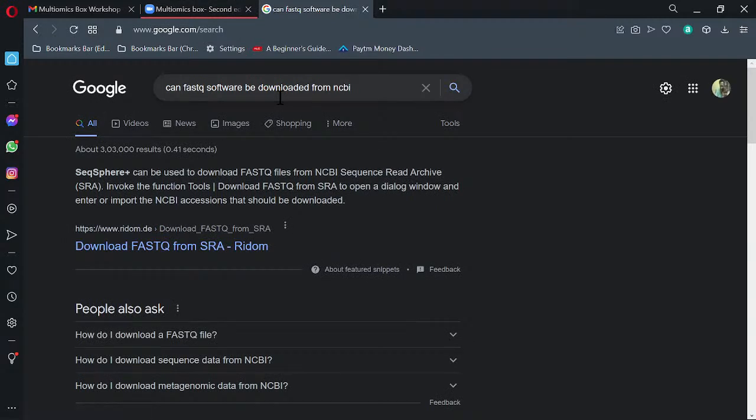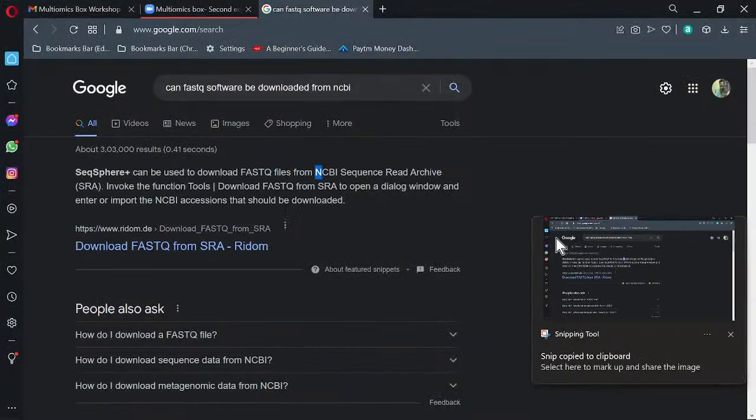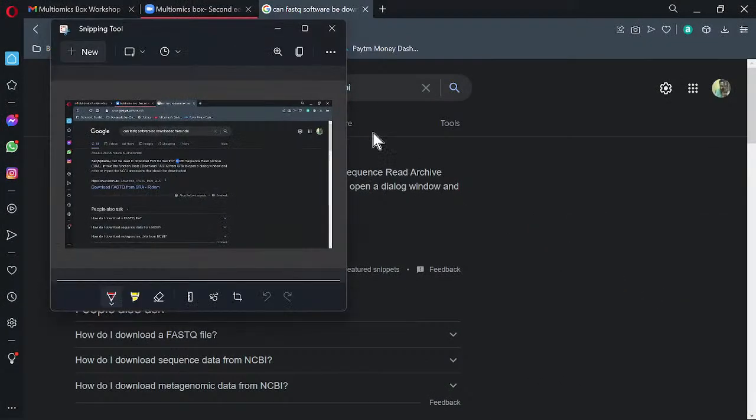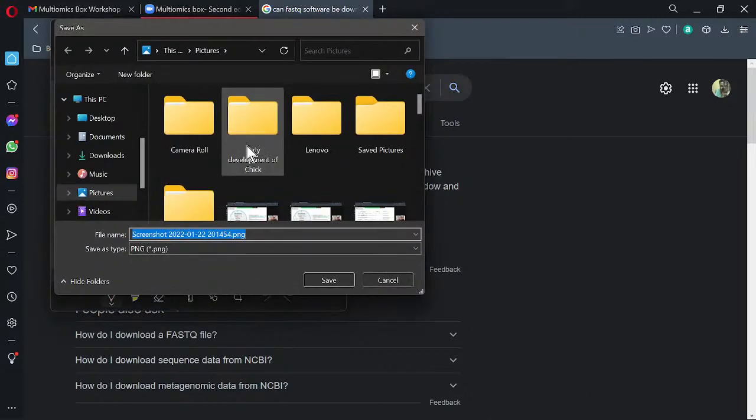Yes, sir. After that, how will we compare the stress with the control samples? So like this, you will download all the 22 degrees Celsius files, and you will download all the 4 degrees Celsius files. You will perform FastQC and Trimmomatic on individual files, and once you get the high quality reads for each file, those files will go individually into Salmon, and you have to perform it for each sample, each condition. It will generate a quantification file.